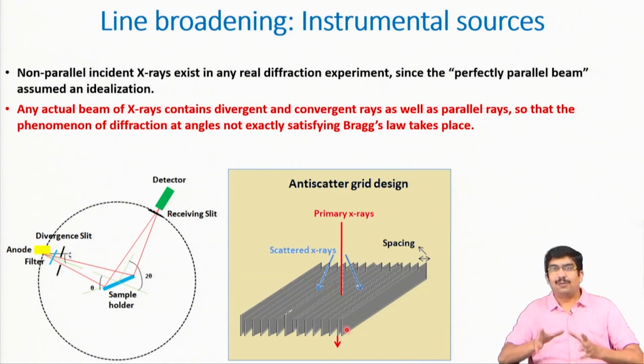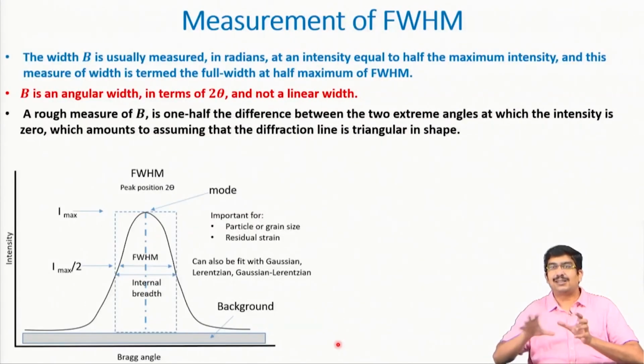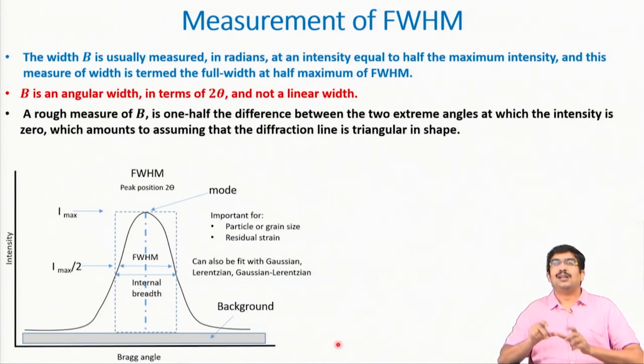And remember one thing: when we were trying to fit this curve and understand various sources of broadening, we do not expect instrumental line broadening to come in, because if a huge line broadening is present, we have no way to identify it or take care of it. In most of the refinement methods that we use, there is no formulation for correcting the line broadening.